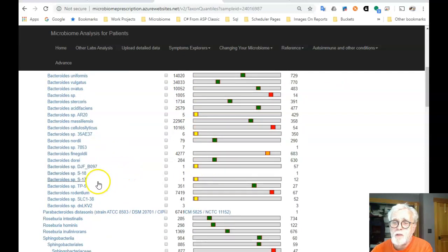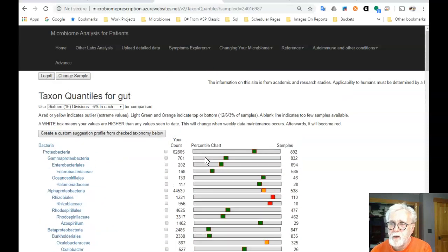You will notice that some stuff appears to be much more sensitive. You can have just one, you can have three, etc. So it looks like we may actually have finer information on it. There's a whole question about reliability, but that's a whole different issue. We have a number of samples here, all the usual.